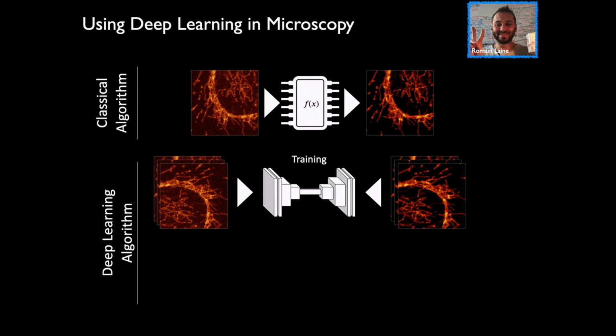Its internal structure and its internal parameters are still free. And what you actually ask it to do is to self-optimize, to train. Pretty much you're saying, can you find optimal parameters within your internal structure by which you find a way to transform the image that you see on the left into the images that you see on the right?